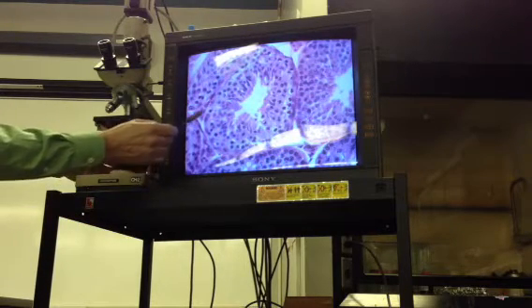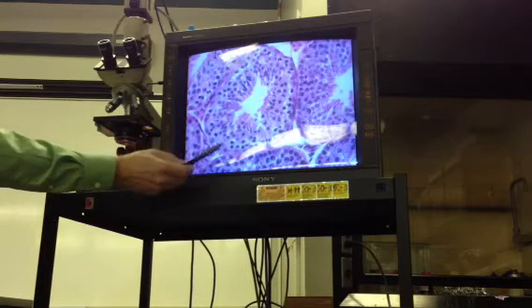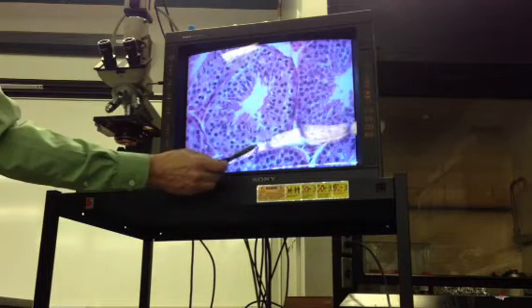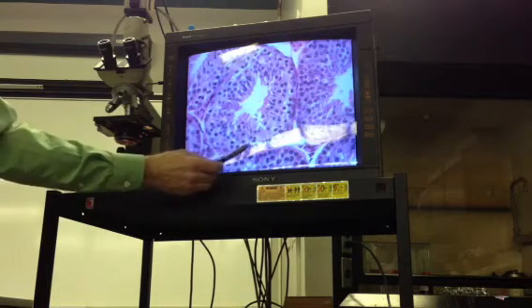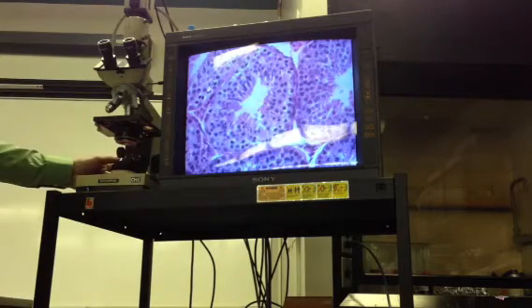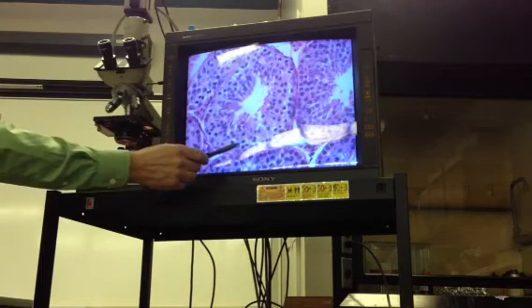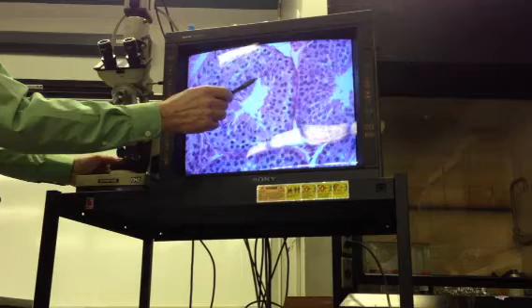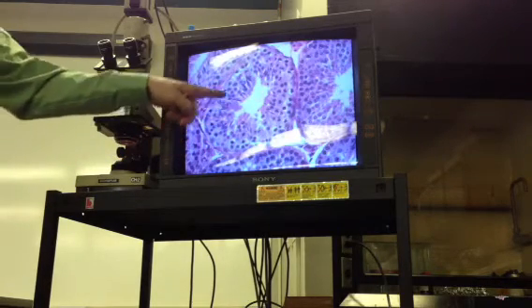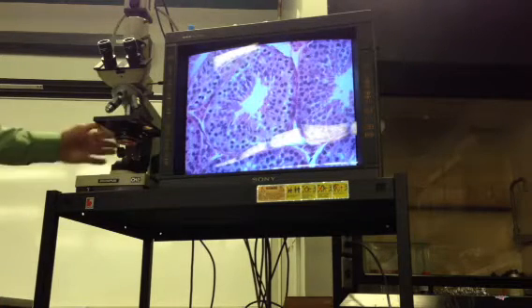Also, there are some spermatogonia which are not heavily stained, but lightly stained, but they have very round-looking regular nuclei. These irregular or elongated nuclei with this sort of variegated staining are Sertoli cell nuclei. But the heavily stained cells near the periphery are always spermatogonia. And the ones that look like thin stripes of purple are spermatozoa, mature sperm.